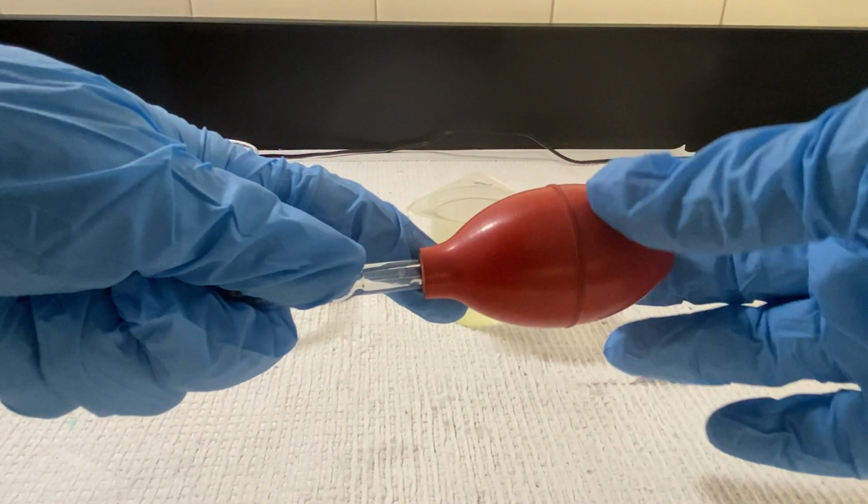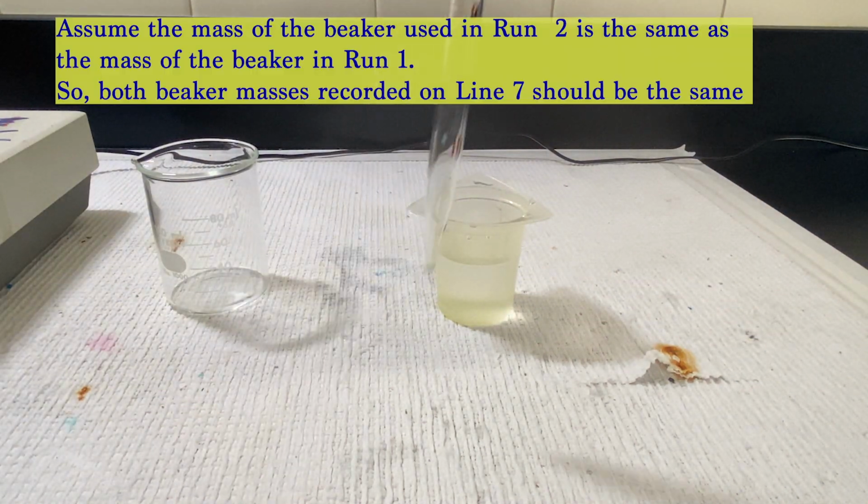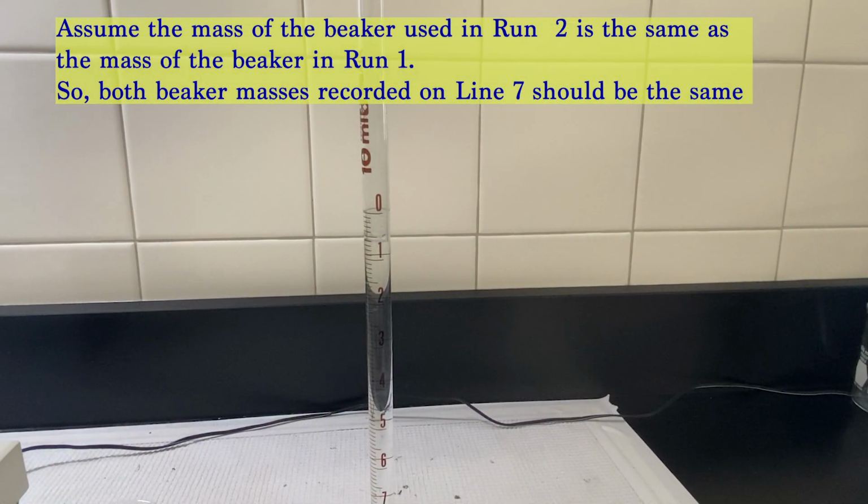With run 1 completed, we're now going to make run 2 with the Mohr pipette. This time you'll make both the first and the final readings with the Mohr pipette.